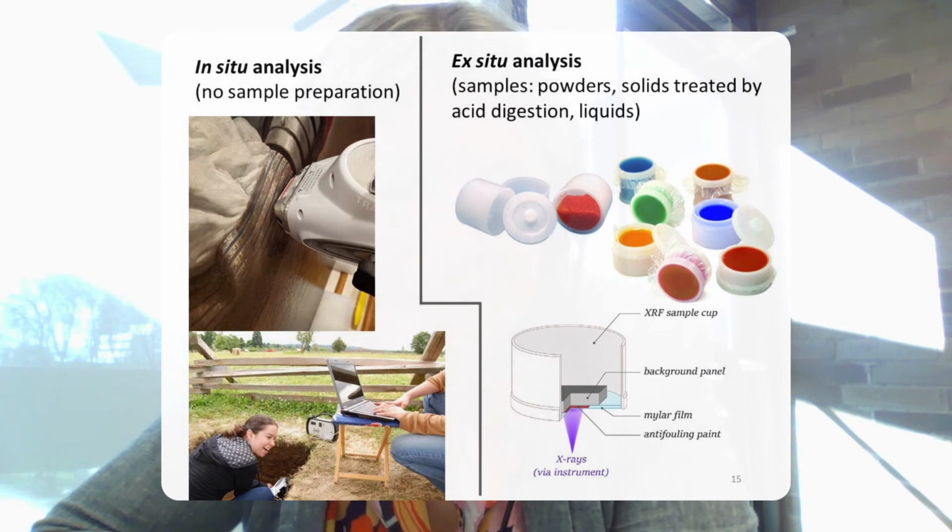Samples for spot analyses should be homogeneous, well mixed, and contain fine grains, if reproducible spectra are desired. The working distance, which is the distance between the sample and detector, is less than a centimeter. XRF instruments are often mounted on a tripod to keep them steady while spectra are being collected.